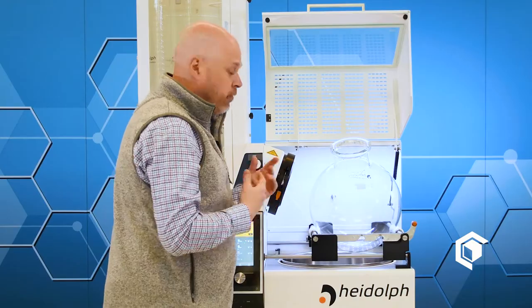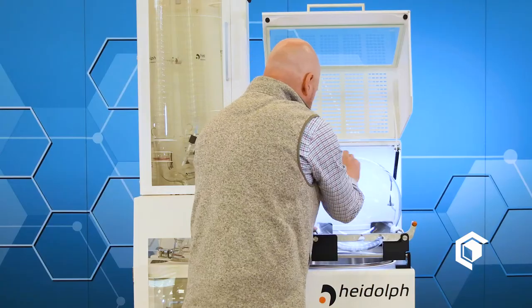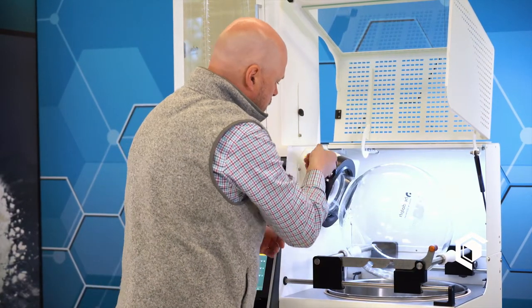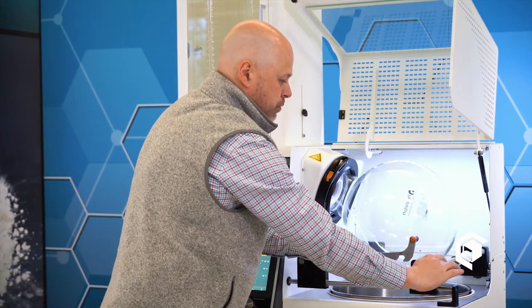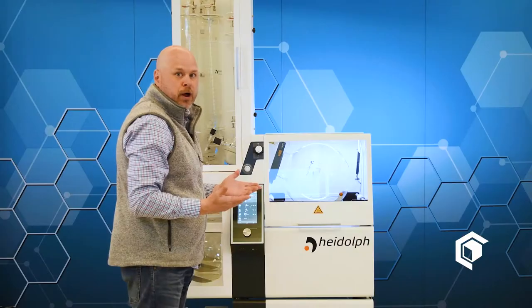To reassemble the evaporation flask onto the Heidolph Industrial, all you do is put it back on the stand, just push forward — these are spring-loaded — and then just lock it in place with the lock button. Take it off lock, take the support beams, shut the hood, and you're ready to run your rotary evaporator.